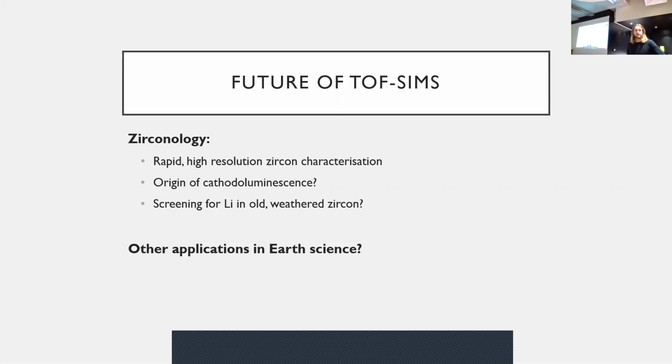All right. Anyone have more questions? I've actually got one. About the trace element variations within a single crystal, it's usually only related to depth, in concentric sort of zones. Sorry, what do you mean? Does the trace element differ as you go deeper into the crystal, as the laser ablates deeper?